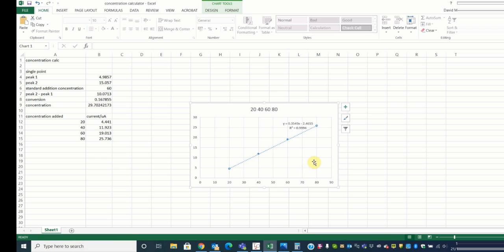If your plate has any degradation or imbalance, or areas where the plate has not taken as thickly as others, or a seed has attached to the electrode during plating, causing a denser area of gold film, then this will affect the rate of reaction of your electrochemical process, which will affect the observed current that you are getting.